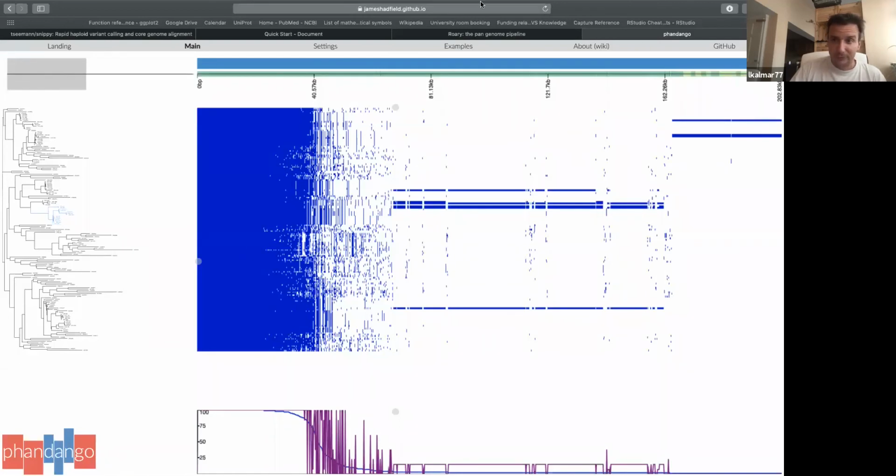And finally, one more thing I would like to talk about today is what you can do if you want to compare multiple genera, or for example, if you have a metagenomic sample where you have a complete mixture of everything, but you want to get at least some kind of output about them.